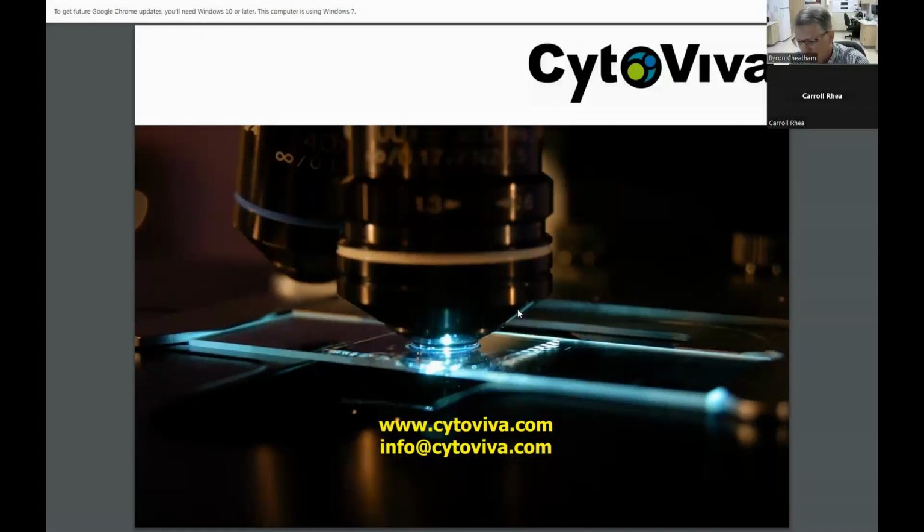There also can be a need, and this is not so much on the research side, but maybe on the clinical or in more material science quality control side, to go really fast, to capture large amounts of data and to analyze that data, let's say in a silicon wafer environment. One of the things that CytoViva is looking at are ways to be able to capture spectral data, maybe on a more limited format, a lot faster, and to also be able to analyze that data in real time through all of these really rapidly developing AI algorithms that are out there. Those are some of the things to try to improve on what are some of the limitations, but those limitations are really related to taking it and advancing it beyond most of the basic research that we're doing today, I would say. Okay, thank you.